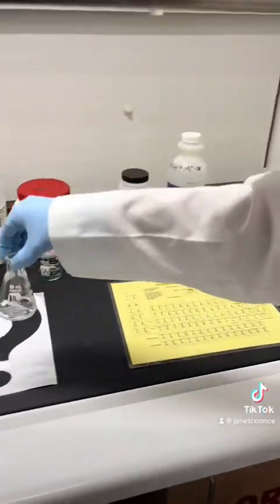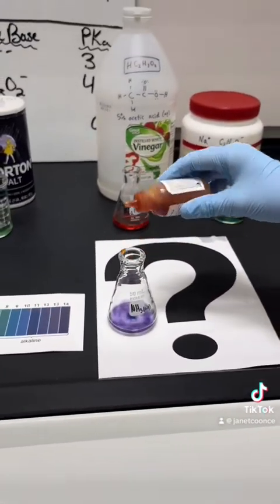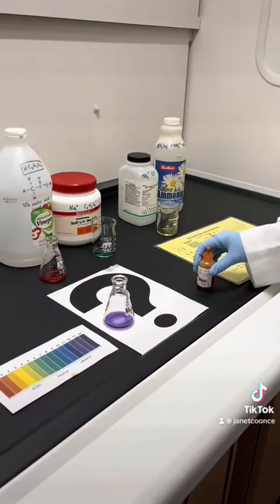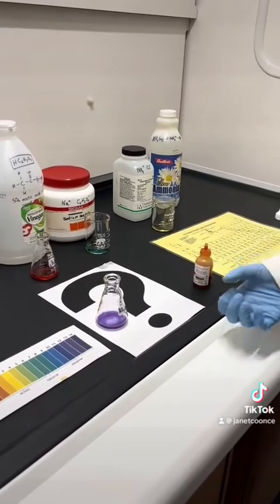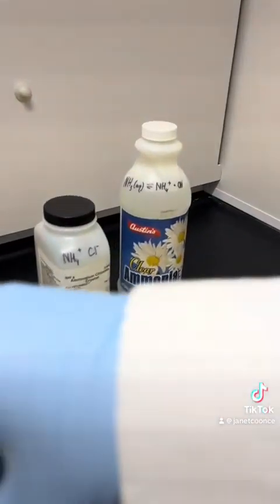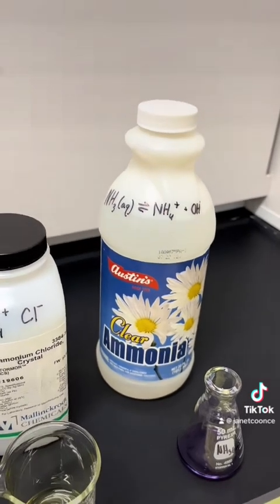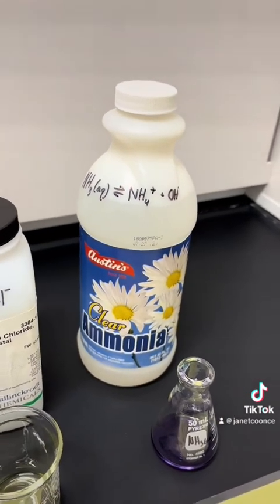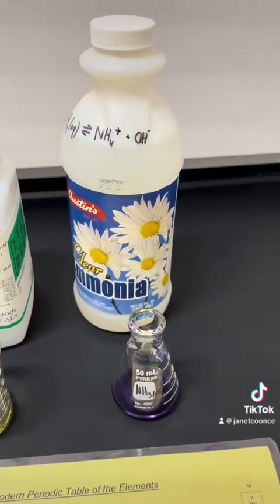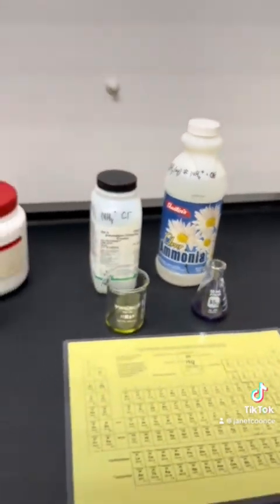What do we see? So right here we have ammonia, and if we add... So this is household ammonia. Oh. Very cool. And it turns this nice pretty purple color, and what we can tell from this is that it's basic, it's got a higher pH, and we have hydroxide anions. So household ammonia is just you take ammonia gas and you bubble it through water and it forms the ammonium cation, which is a weak acid, and then OH minus, which is a strong base. That strong base is what gives us that very, very high pH, high concentration of OH minus anions.